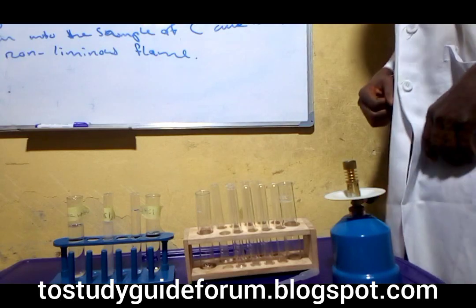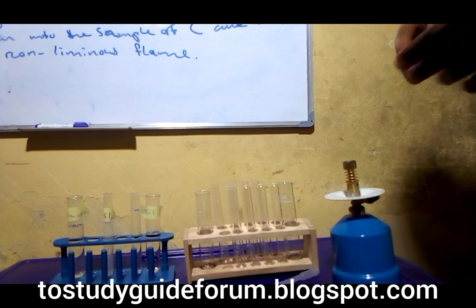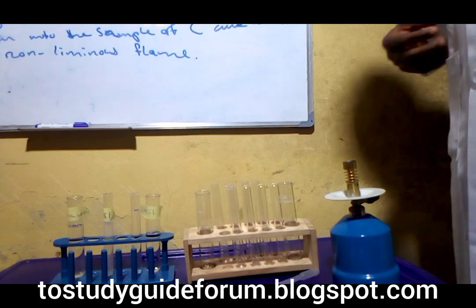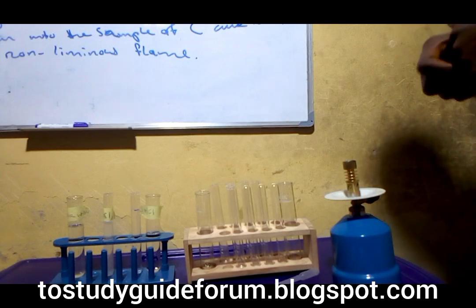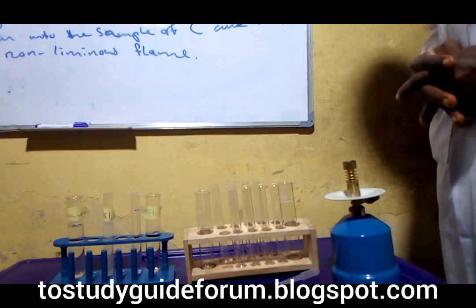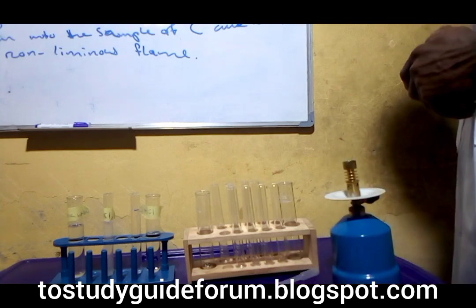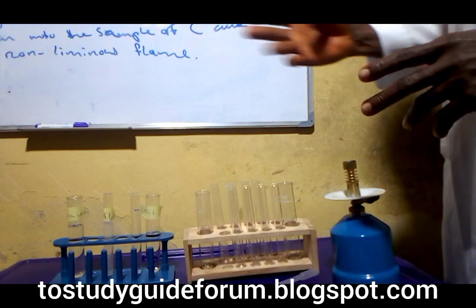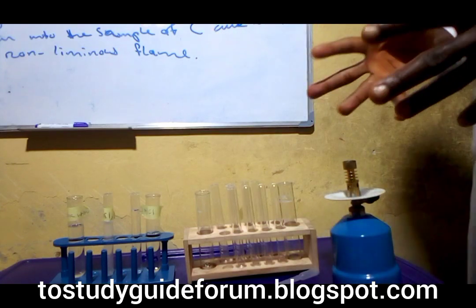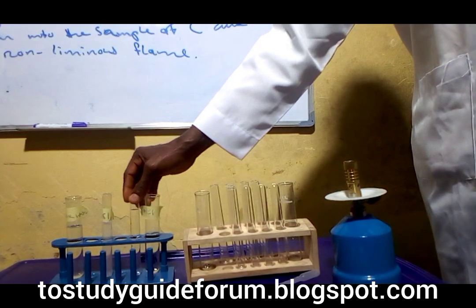Here we're going to be looking at the analysis of sodium trioxocarbonate in preparation for the exam that's coming up. We have all our reagents here: our sodium trioxocarbonate, lime water, barium chloride based on the information given, an acid, and our distilled water.